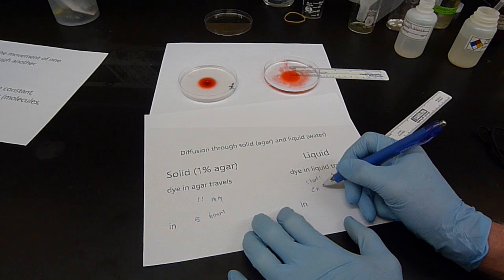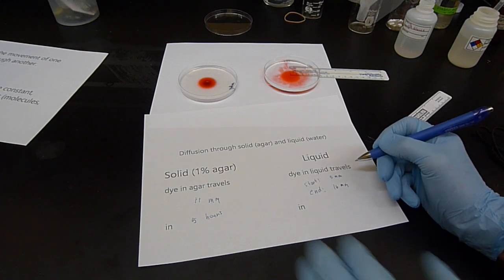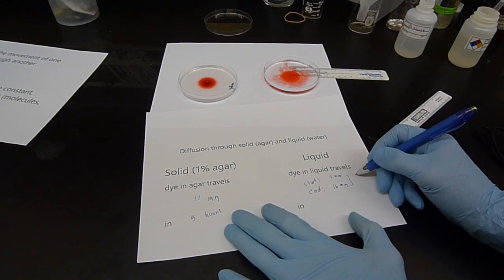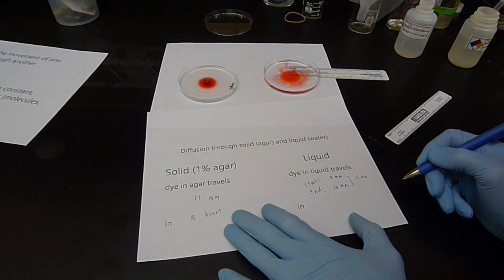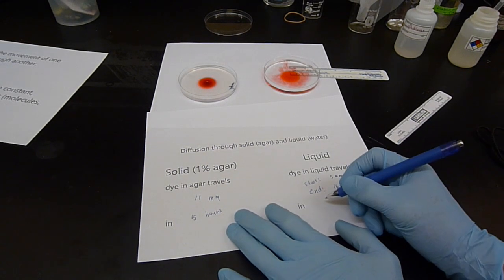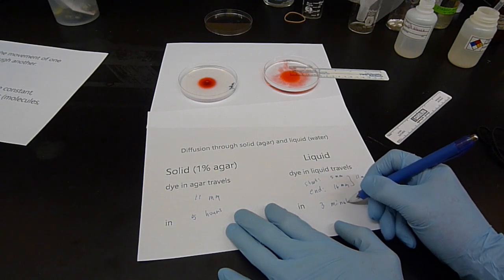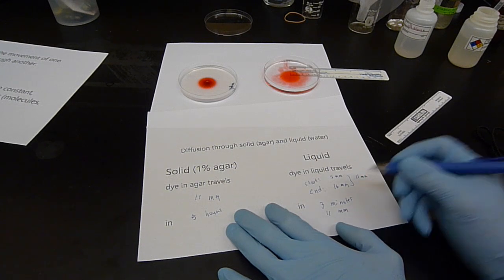So at the end here, it went to 16 millimeters. So if we do the subtraction, initially 5, 16 at the end, that's going to be 11 millimeters that has actually diffused in 3 minutes. So in 3 minutes, in just liquid water, it's diffused 11 millimeters.